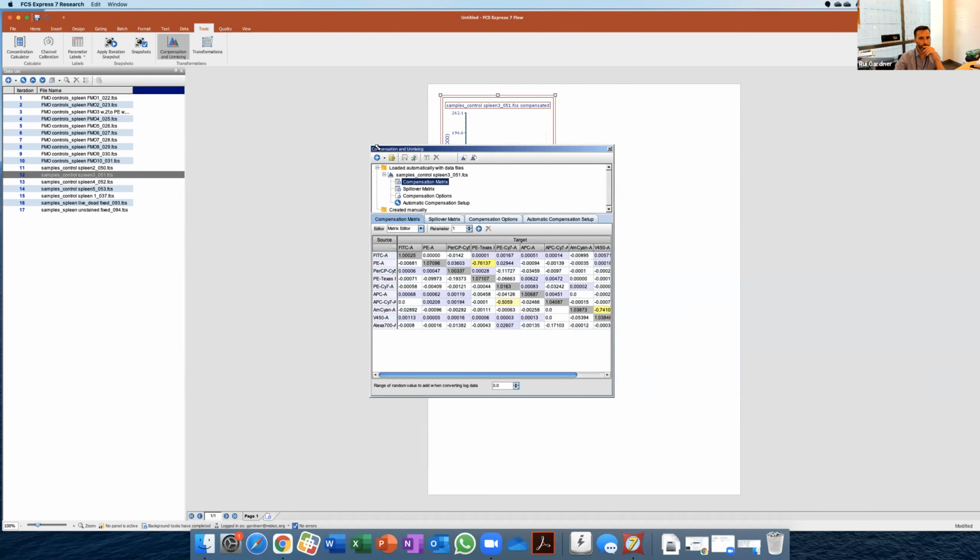Yeah, so very likely it's a question of remembering where those things are. Exactly, it's easy enough to get them. I knew that there was a way to show that, because these are the things that we need to expect. If a software doesn't have access to that, then there's something wrong with the software. We should be able to see these things.